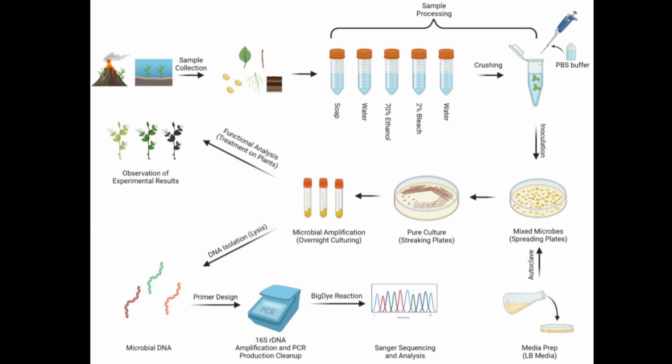First, the plant samples were collected from Site 13, and then microbes found with them were isolated and screened. Sample 1 was Potamogeton crispus, a curly-leaf pondweed. Sample 2 was Hedera helix, a common ivy. Growth media was made to grow the microbes.